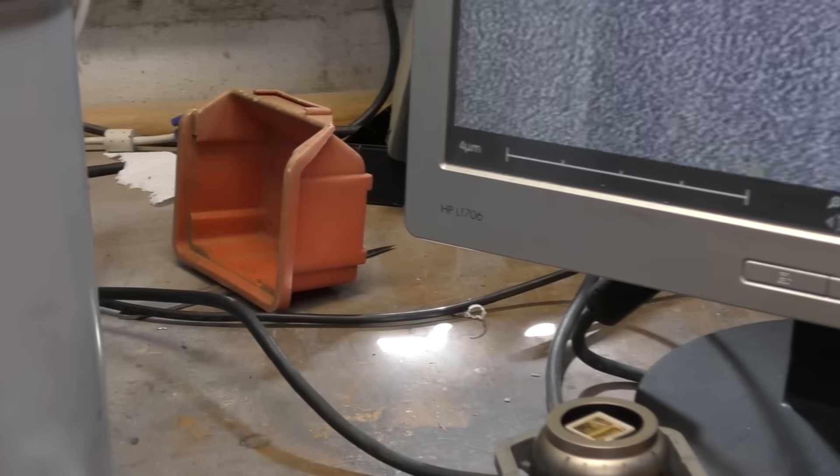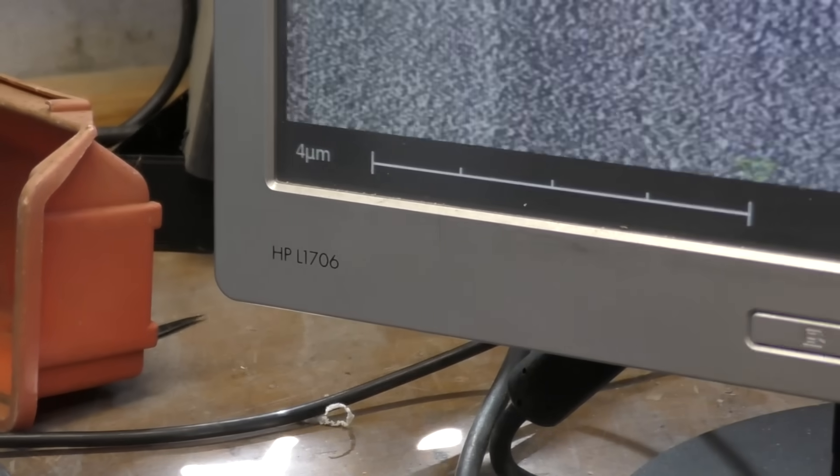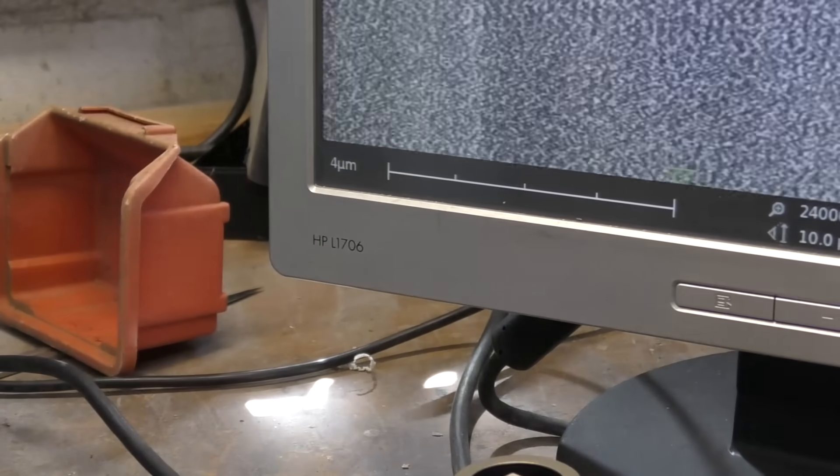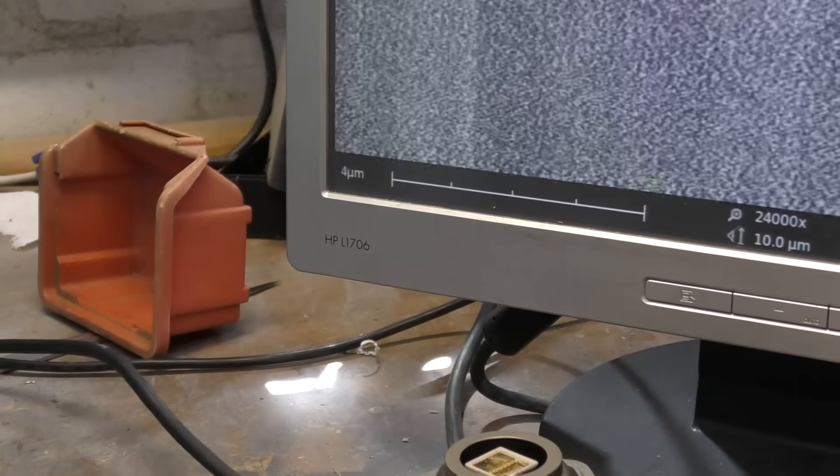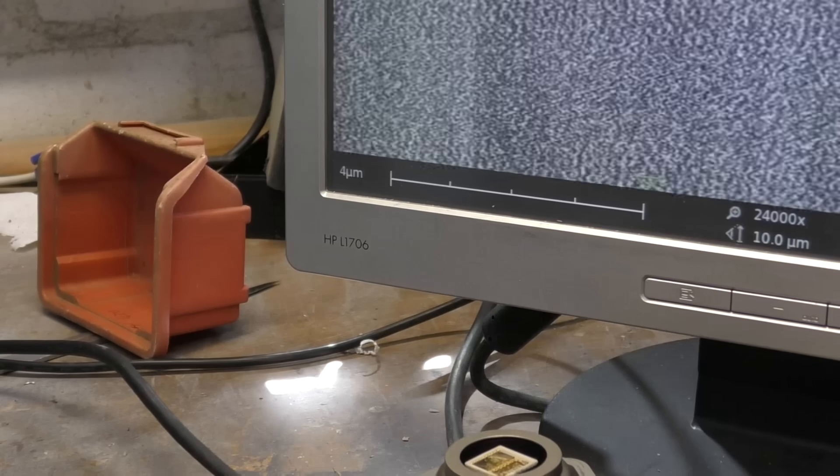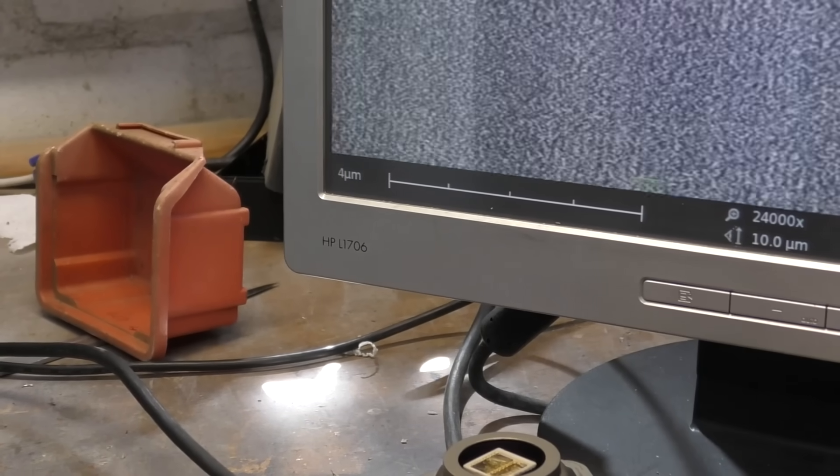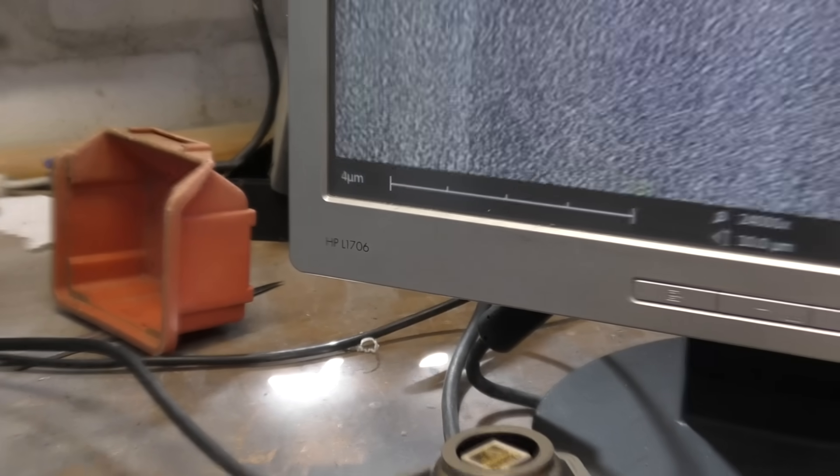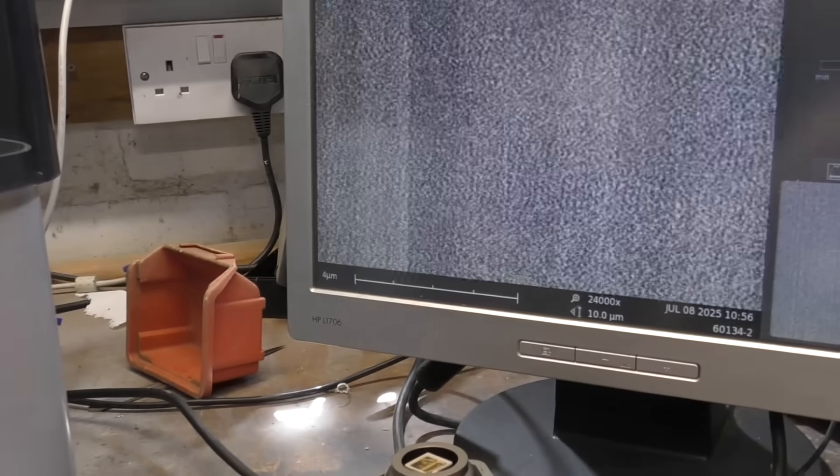So on this scale, each of those small ticks is 1 micron. If this is working, we've got some fairly decent resolution down to about 100 nanometers or so, which would be fun if we can get this thing working.